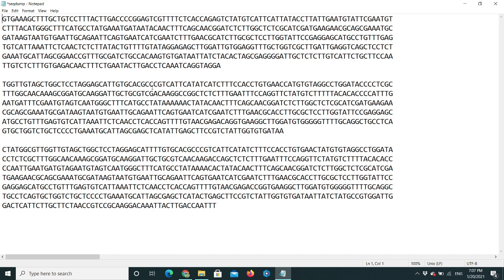You need to change your sequences into FASTA format. On this screen I have opened my sequences in a Notepad file. I have multiple sequences — three sequences — and I'm going to format these sequences into FASTA format, then we will go ahead to visit NCBI and upload these sequences. I will show you each and every step on that platform.